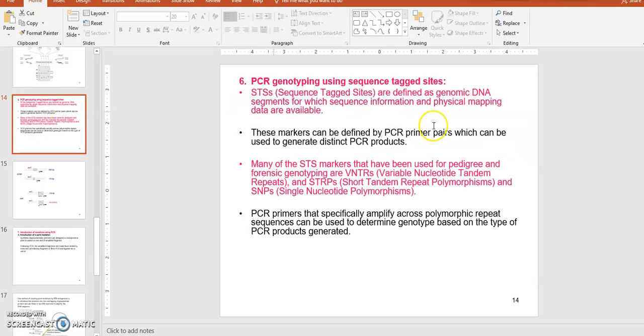Okay. Another application here is genotyping. So think about forensics, where DNA fingerprinting is used, right? When you say DNA fingerprinting, what do you mean? So in that DNA fingerprinting analysis, you use a PCR process. People's genomes are similar in the gene coding regions, as you know, but around the areas of non-gene coding regions, people do have unique DNA sequences.